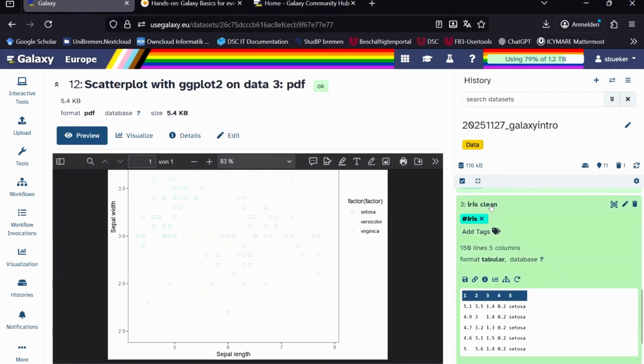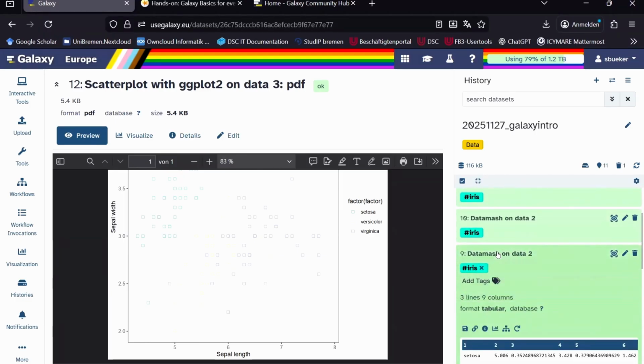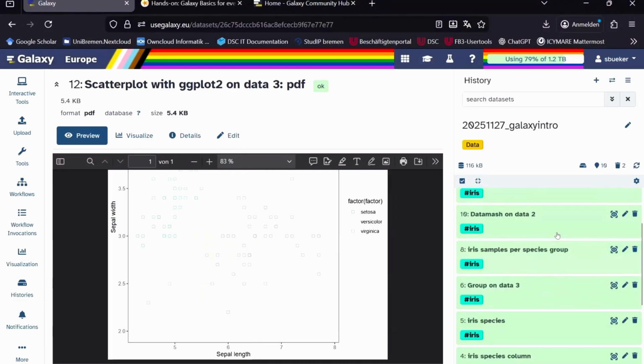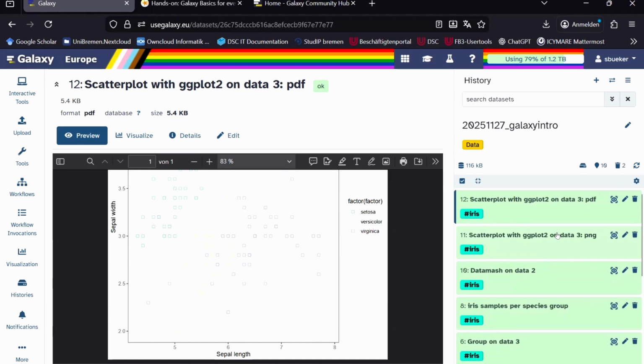I already did that with the one earlier. I didn't do that with the data set yet, where I forgot the header. I delete that now. The cool thing is, when we convert everything to a new workflow, the deleted datasets won't be automatically included.